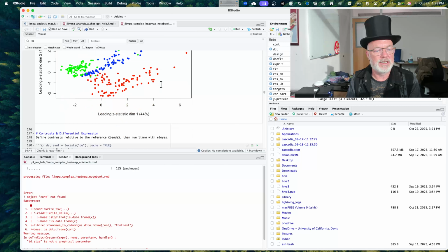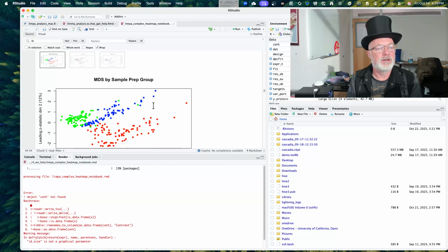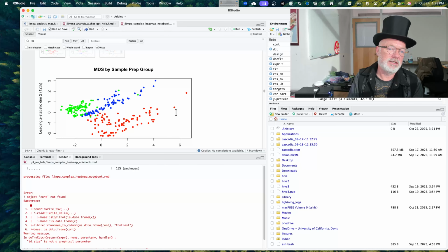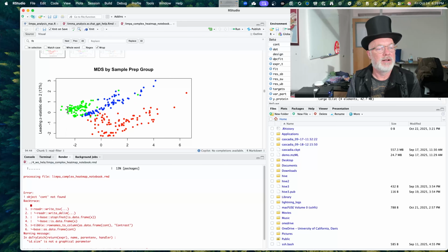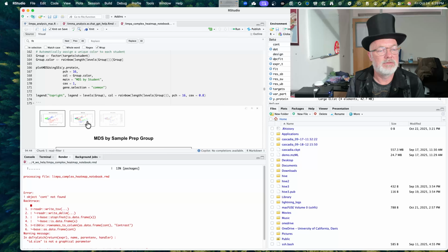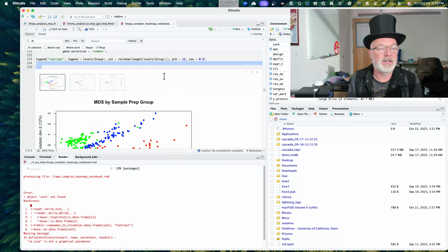So I did this based on group. So these are the 3 different digest conditions, I think. So I think this is S-trap and beads and urea. And then let's see, what are the other ones? This one is by group. So yeah, the 3 different conditions.